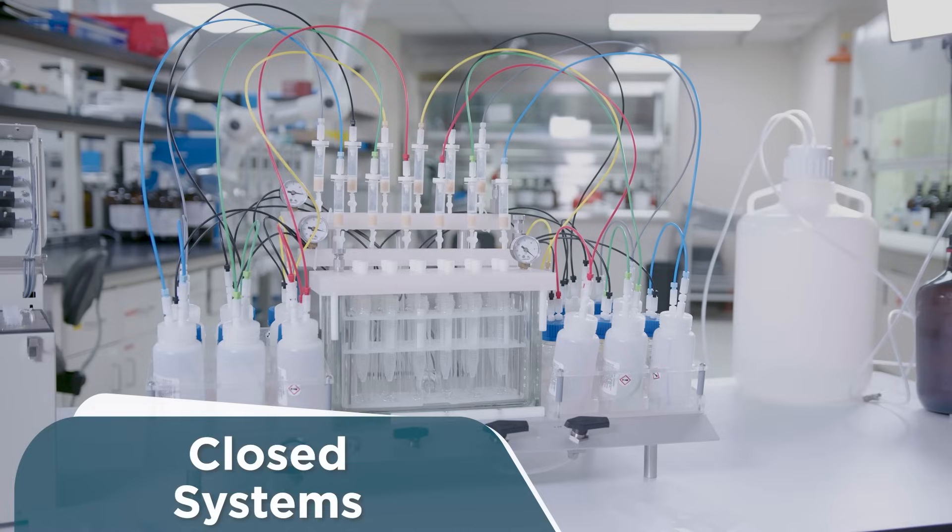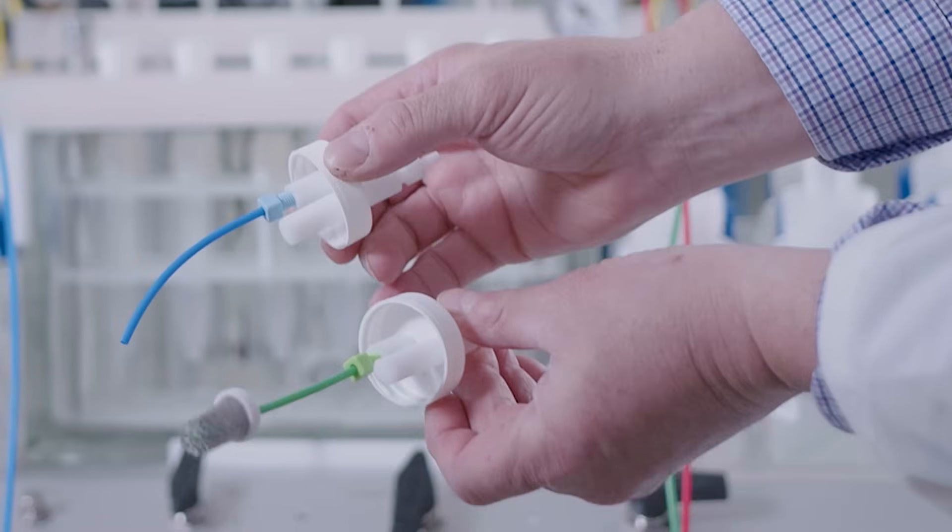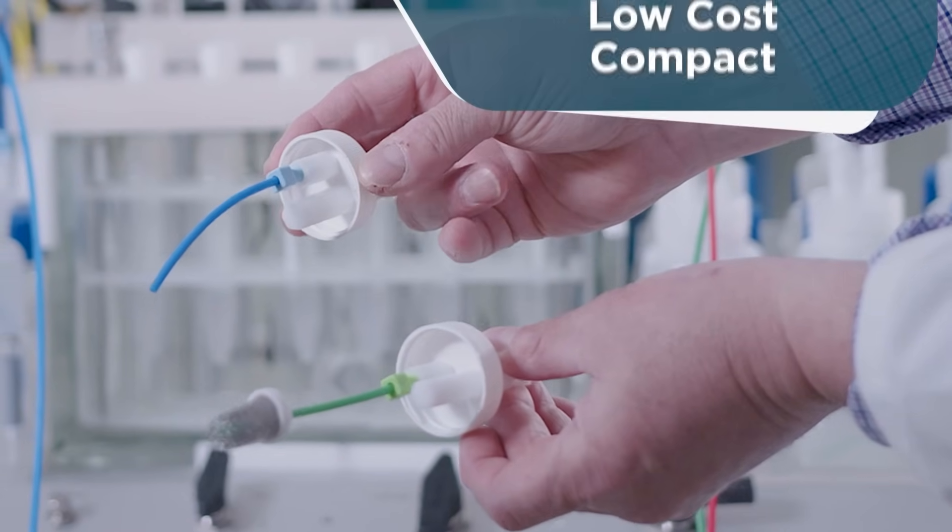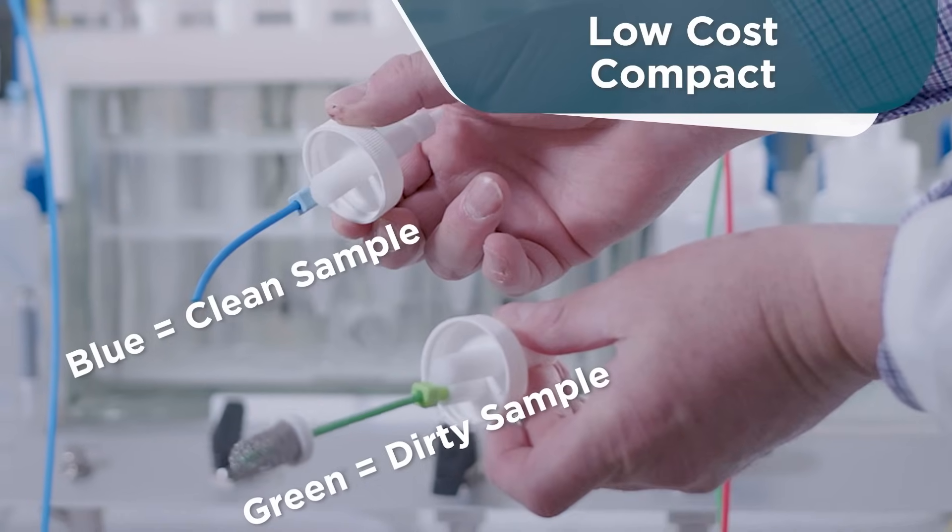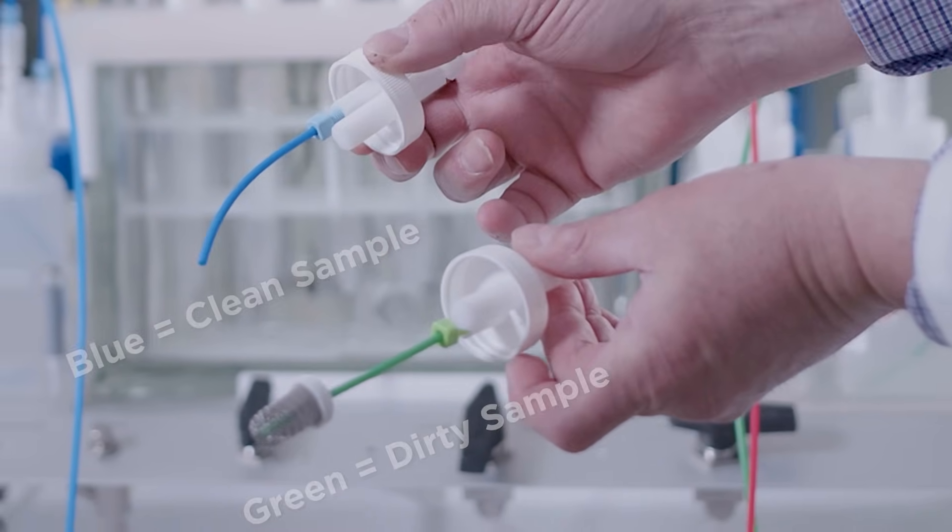The EZPFC is a closed system, eliminating potential outside contamination. The sample bottle cap is adapted by FMS and used for sample loading and automatic sample bottle rinsing. No expensive bottle cap adapters.